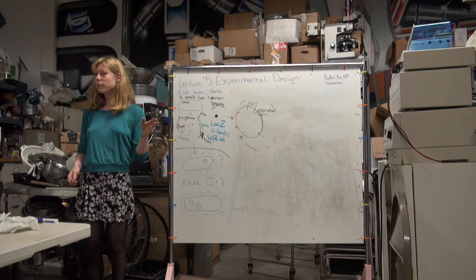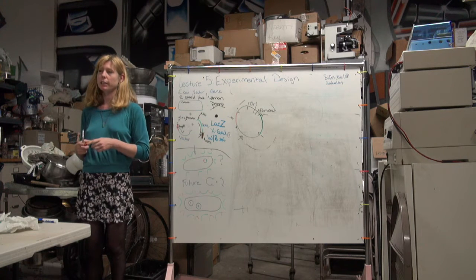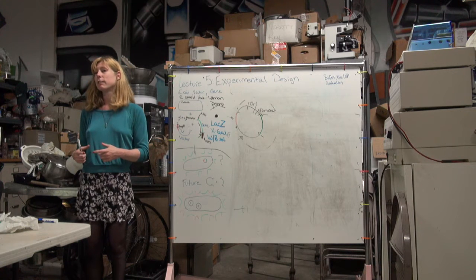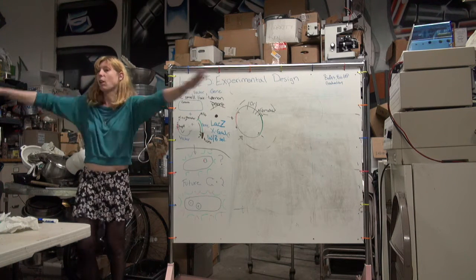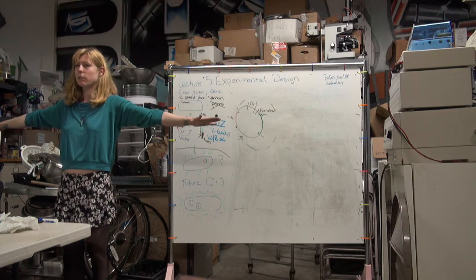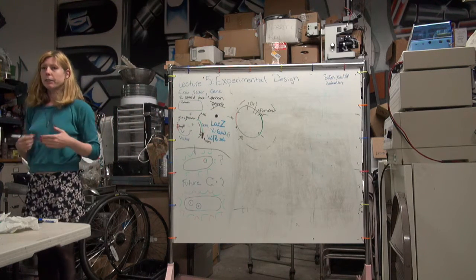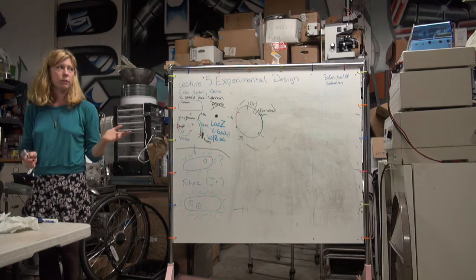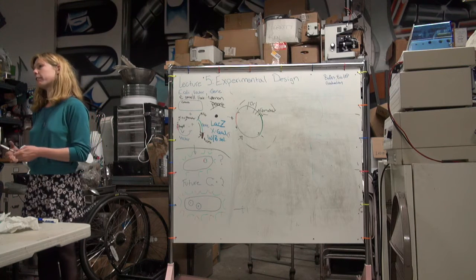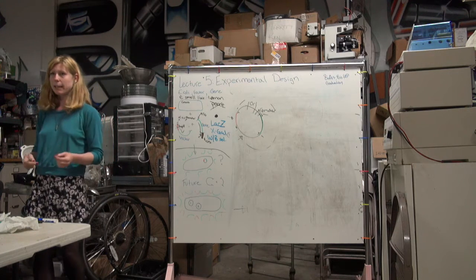When everybody grows, you have to put a much smaller concentration of E. coli on the plate, because otherwise it'll be a lawn. Everything grows. You will not be able to choose one single solitary colony. So you have to plate a lot more bacteria and look through a lot more. Instead of plating maybe 3 plates, you will plate close to 100 plates. You'll have to do the math in terms of the efficiency. And then you might not find it, but you keep the reaction and replate again.